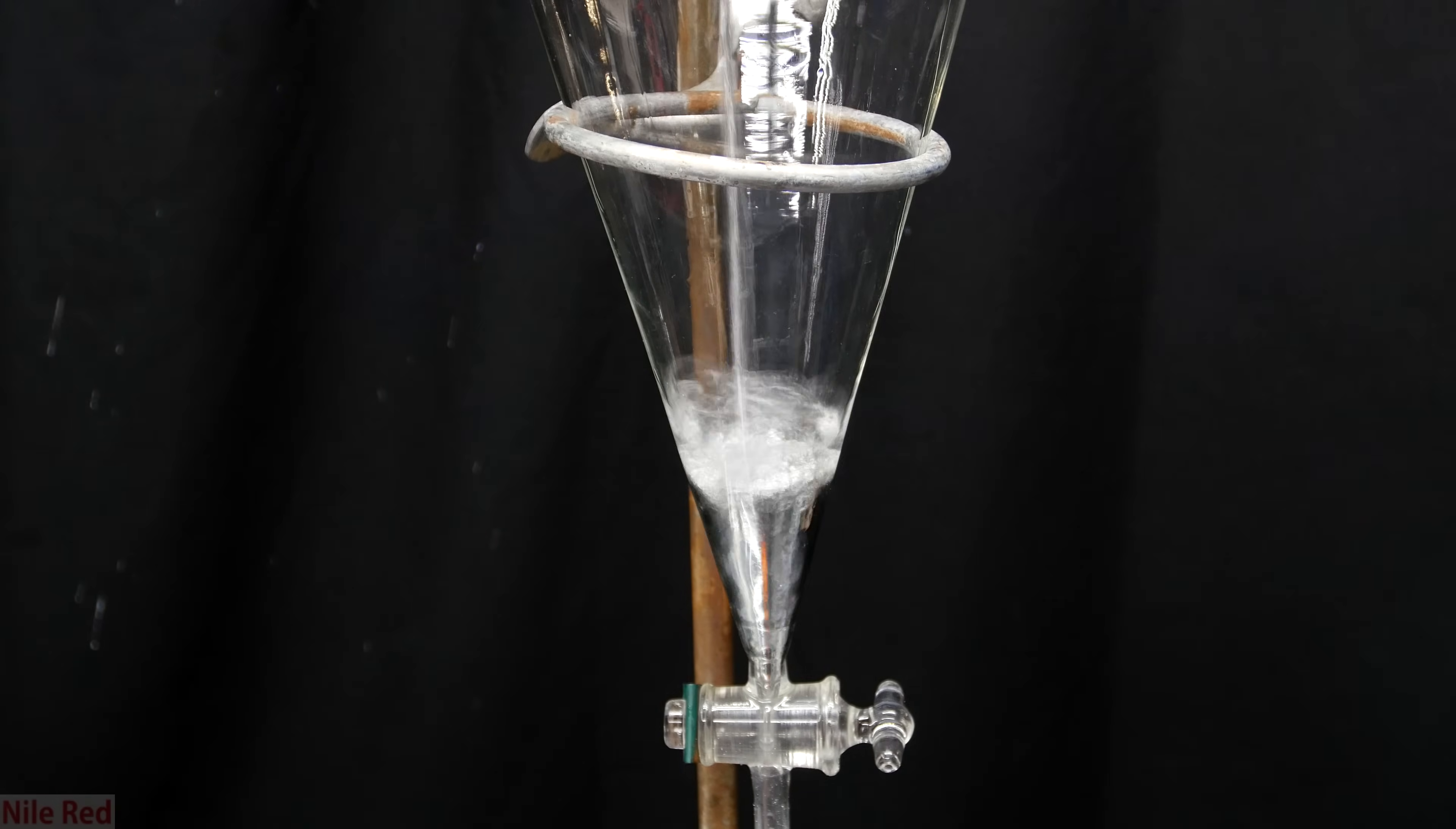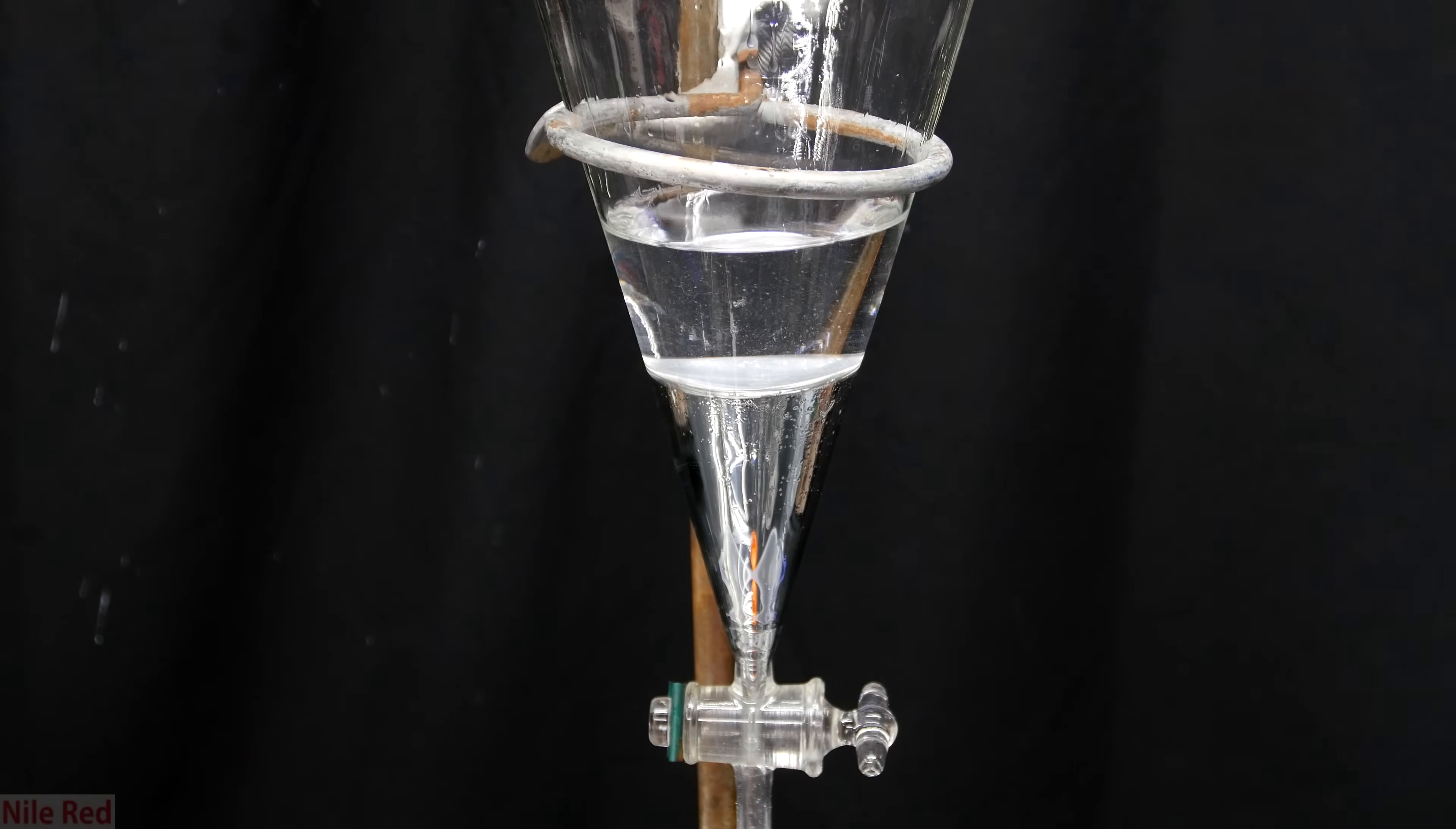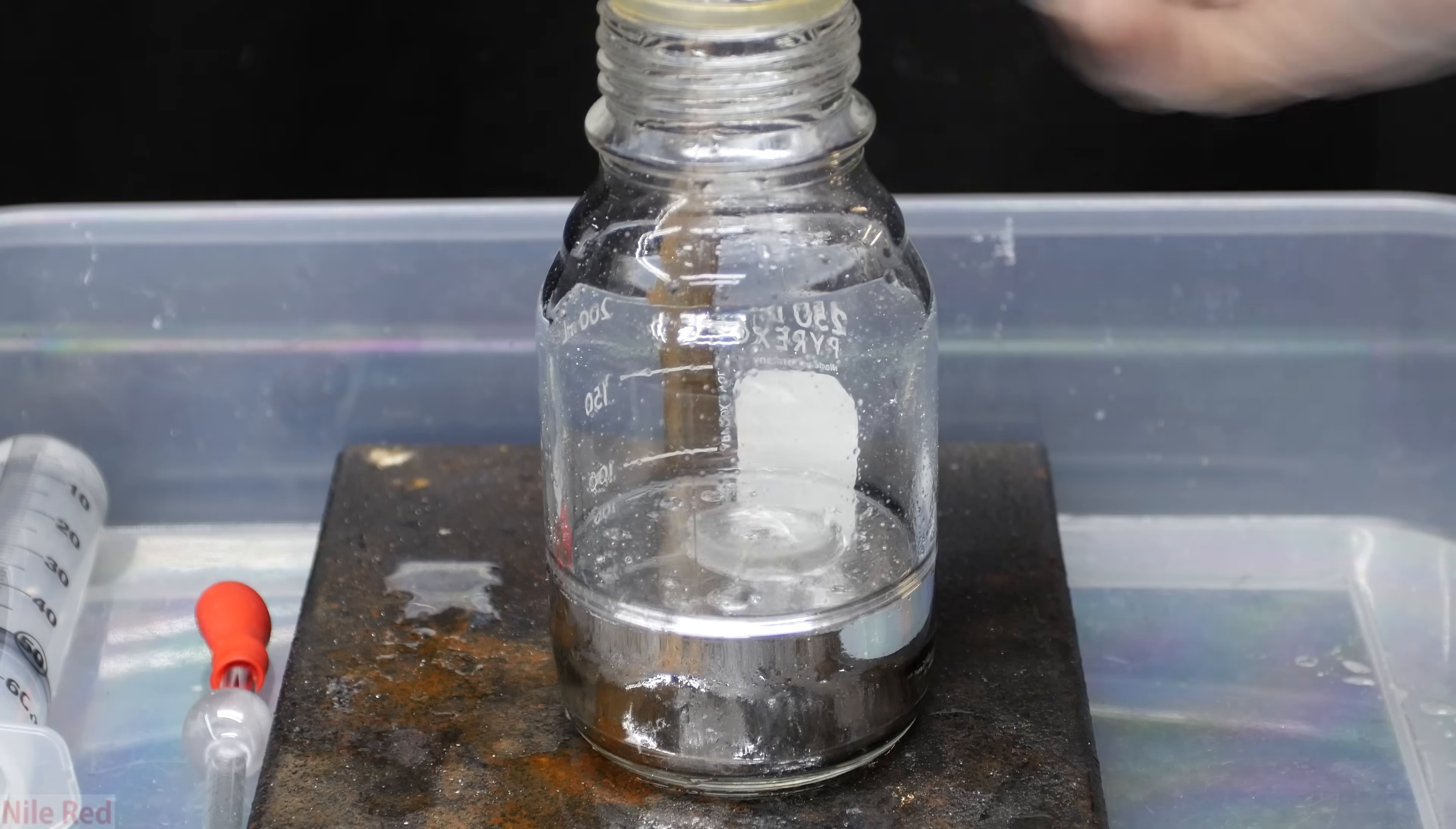To a nice clean separatory funnel, I pour the mercury back in. On top of the mercury, I pour in a few hundred milliliters of distilled water. Then just like with all of the other washings, I cap it, shake it, vent it, and then put it back on the ring stand to separate. The bottom mercury layer is then drained off, excluding as much water as possible.